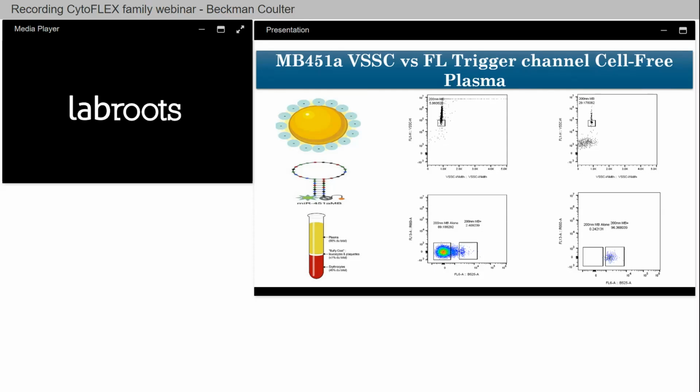We then looked at the fluorescence, was it available? And then we sorted it. As you can see, we started to really isolate the bead population there on the upper right. And we were able to see just the fluorescence of the actual reporter, meaning it bound the free microRNA 451A, as molecular beacons are built to be very specific.